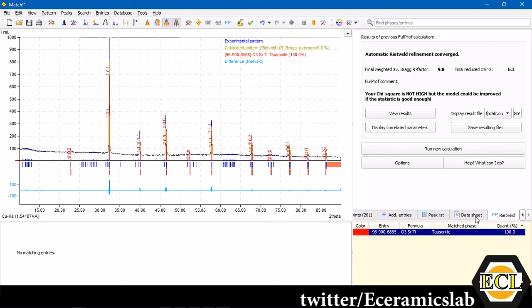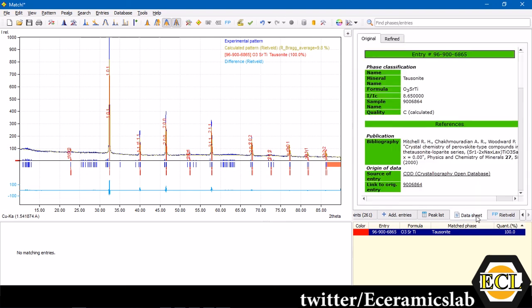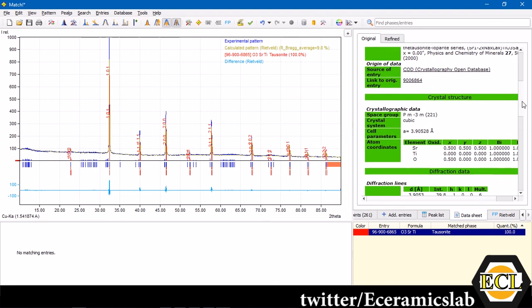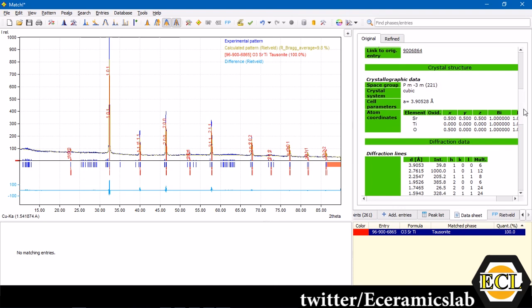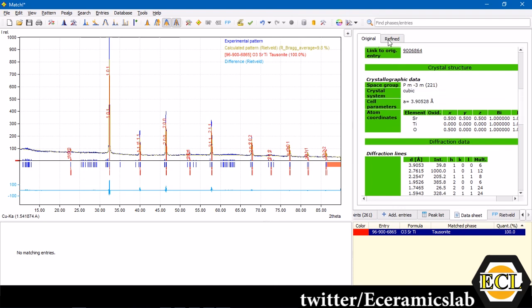Now, again, we will go back to the data sheet and see, this is the original file which you had selected. And now, after the refinement, what are the values which have changed after the refinement? Here, see, the A value was 3.90528 angstrom.